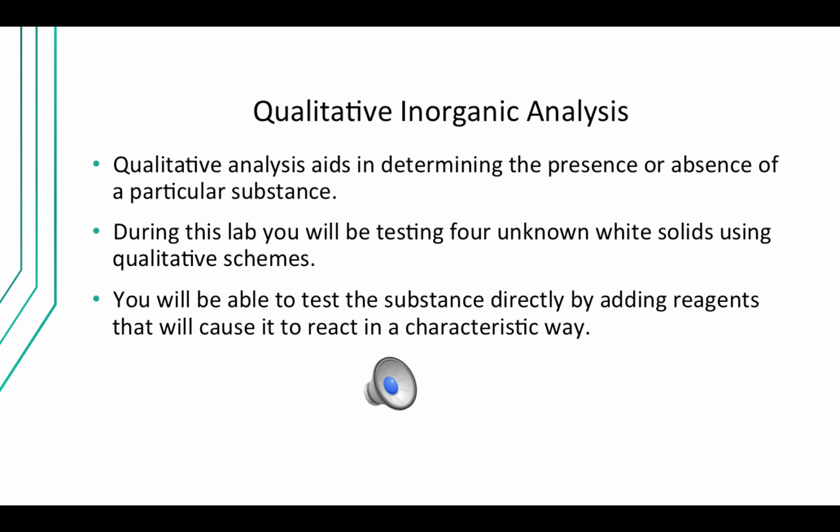Hey, welcome to another video. This is on experiment 5 on qualitative inorganic analysis.